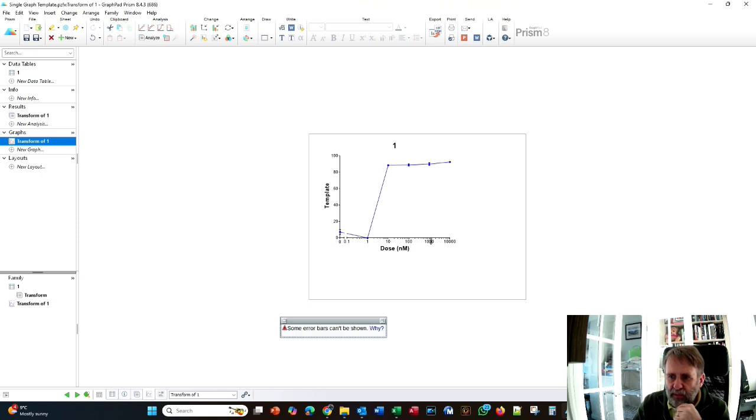But because mathematically it's on a log scale, you have to recode that to 1 times 10 to the minus 10 or something which is a positive value, because obviously it's not possible to plot 0 on a log scale. So that's exactly what I've done. Okay, so that's how I deal with the dose response. You may want to deal with it a different way. This is just how I do it, and obviously for the particular exercise that we're about to do, we're going to use these particular templates. So this is the first template that I've created.